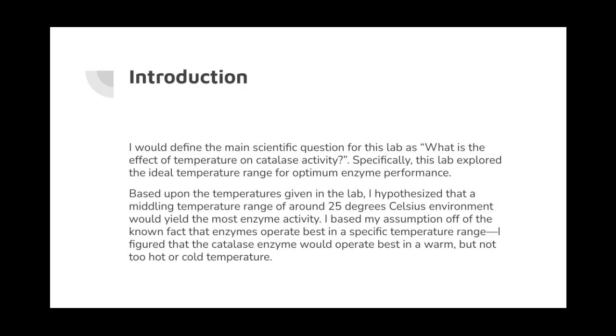My hypothesis, of course, was 25 degrees would be the most optimal temperature for this specific enzyme. I based this not necessarily on common sense, but regular cells can't operate when it's too hot or too cold, so I figured 25 degrees is in the middle, so it would be the best option for this lab.